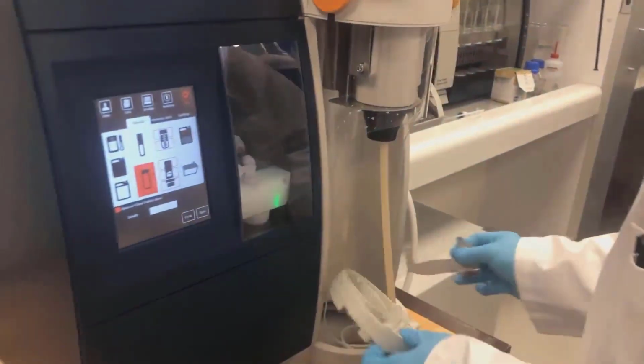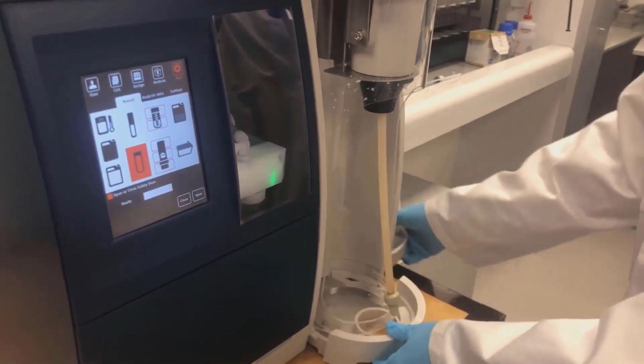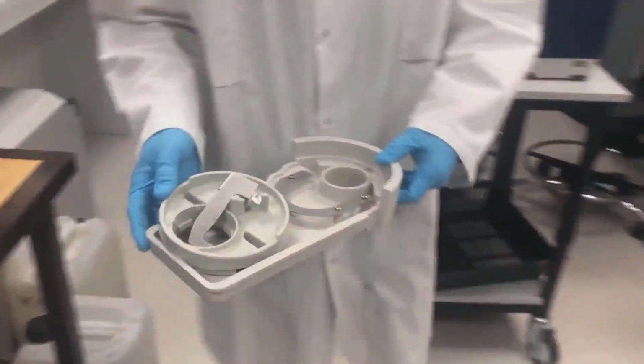Here you can lift up a fixer and then take out the drip train. Then there's a tube support. Then there's a drip train you can take out here. So we can place these in the basin for the cleaning.